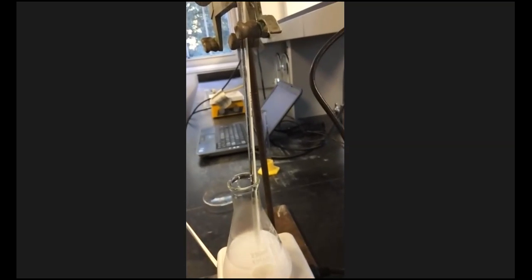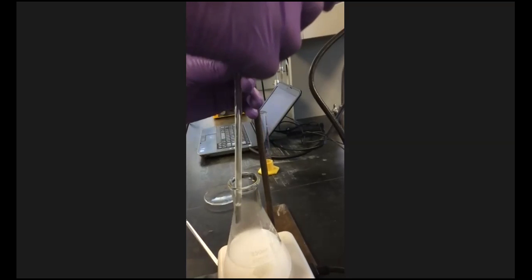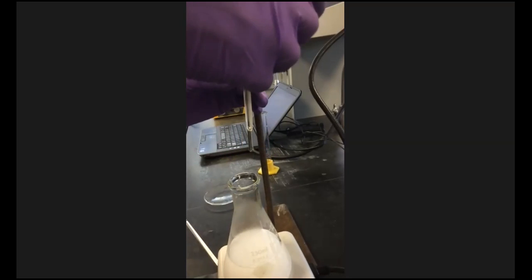So we just want to keep it consistently warm, and we don't want to heat it past 75 degrees. All right, that's the goal. Once it goes past that, you're going to drive off the water on your calcium oxalate, and when that happens, that's trouble, right? Because then your net ionic equation changes.